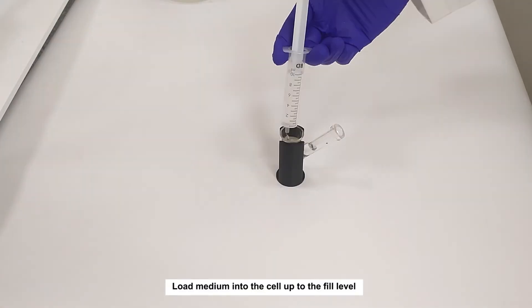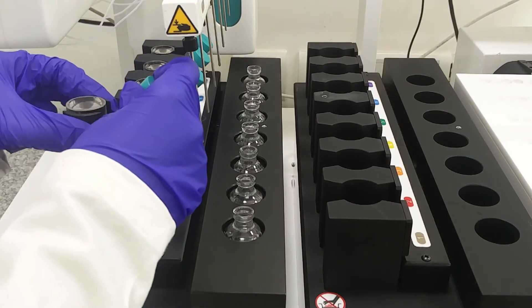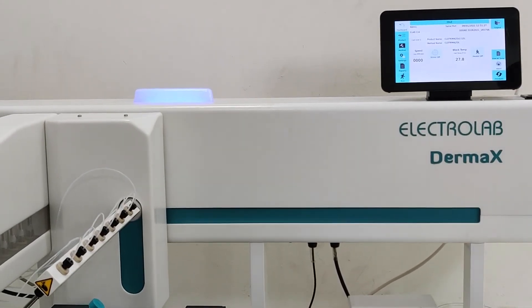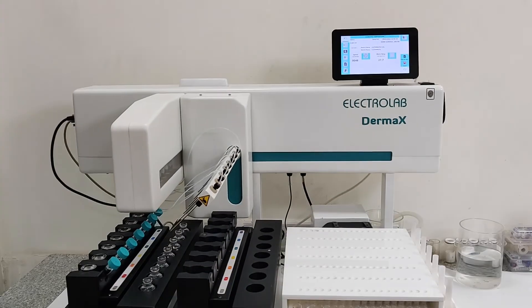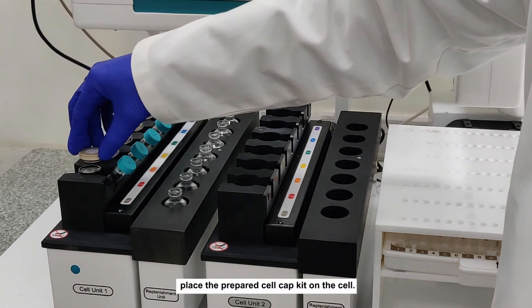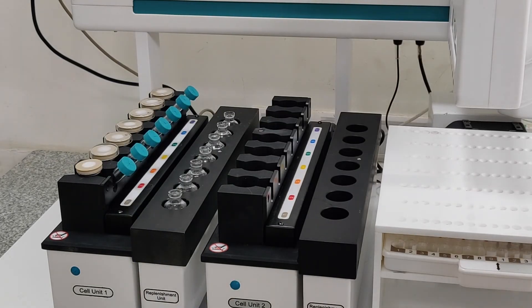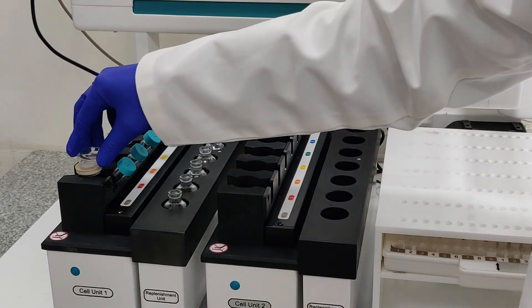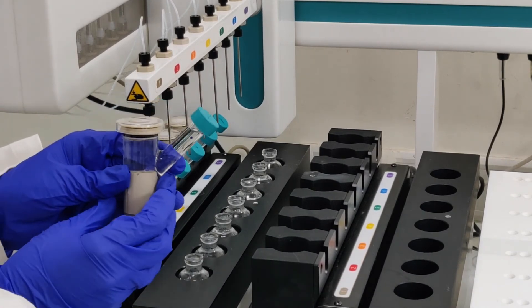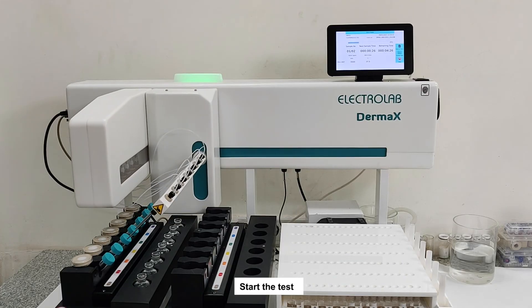Load medium into the cell up to the fill level. Place the cells on the dry block and start the test. Once the temperature reaches testing temperature, place the prepared cell cap kit on the cell. Remove the cell from the block and tilt to take out the entrapped bubble. Start the test.